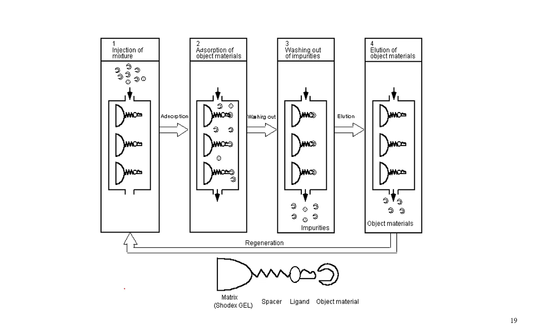What happens in this elution process? The elution buffer might have some ions, or other compounds or components, which would bind to this bead and release these during elution. So it will release this and then this, and finally you would be getting your protein of interest.